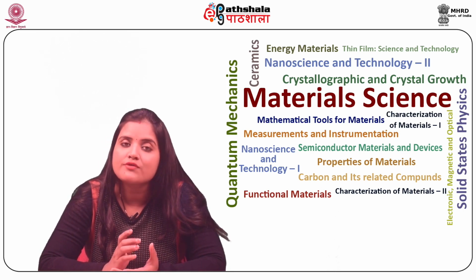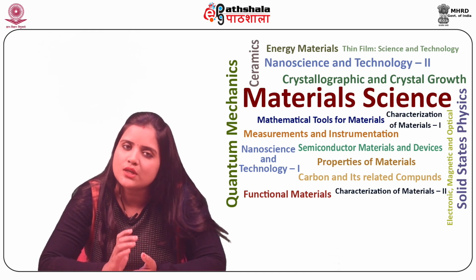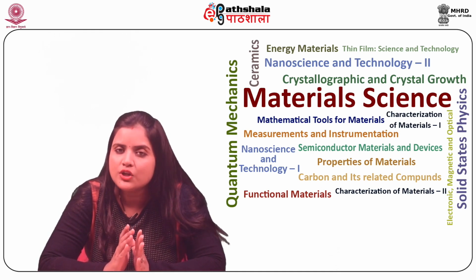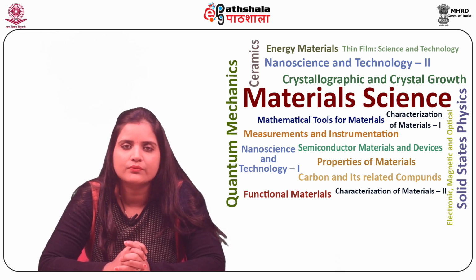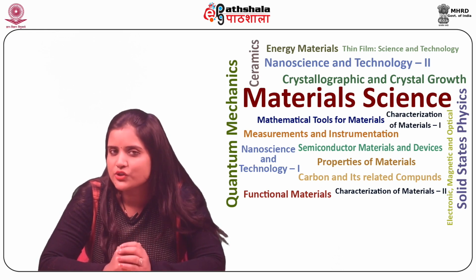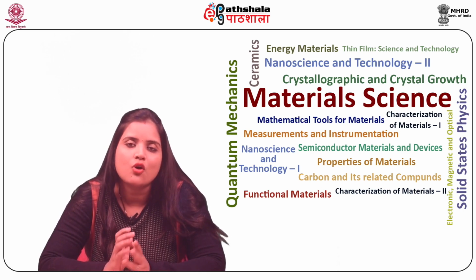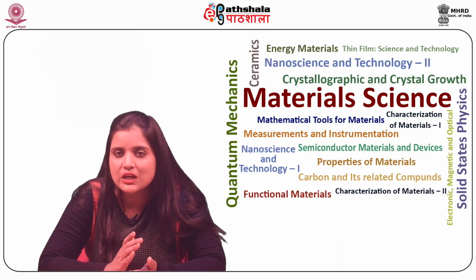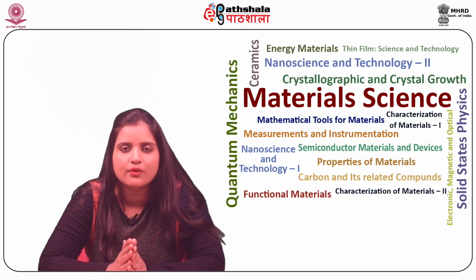Another advantage of scanning tunneling microscopy is that the atomic arrangement on the surface can be obtained by measuring the DOS of the surface atoms. Now, moving on to the disadvantages of STM. STMs are complex to operate effectively. It is a highly specific technique which requires great skill and precision.